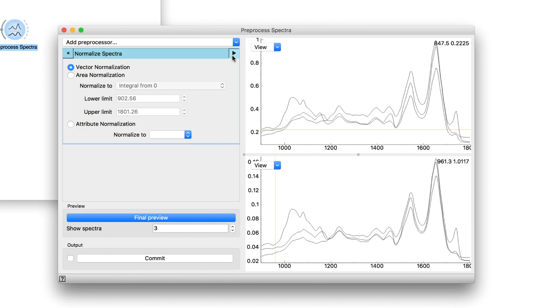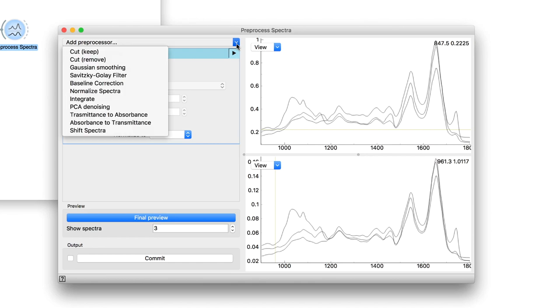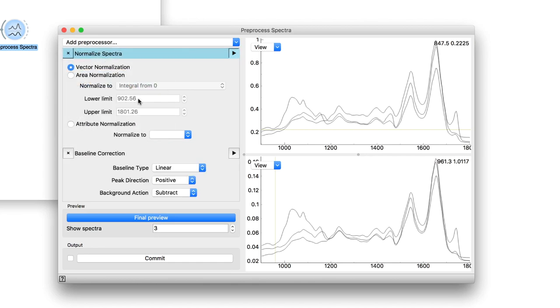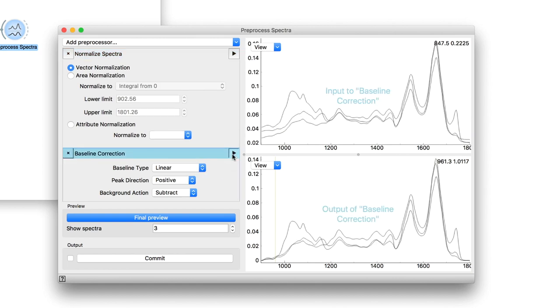Next, we could do a simple baseline correction by selecting the appropriate method from the drop-down menu. If you select the title bar of the preprocessing step, the view on the right follows the selection and shows you the effect of the actual preprocessor.